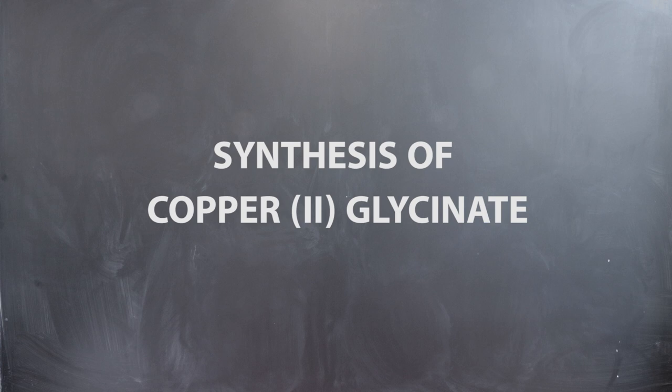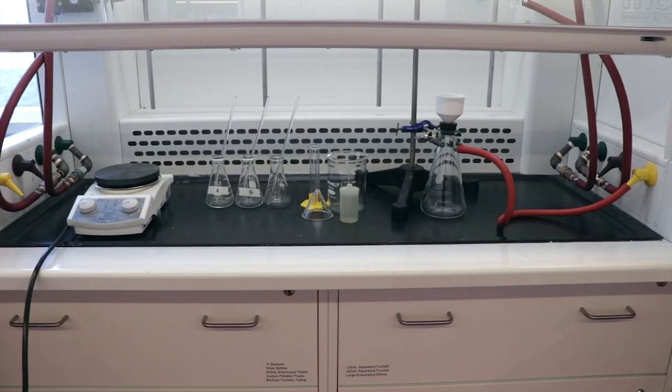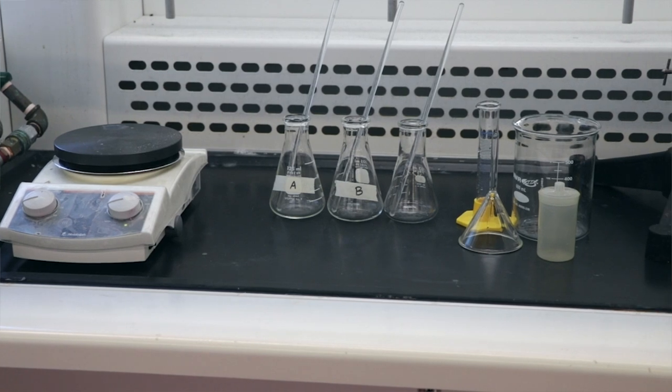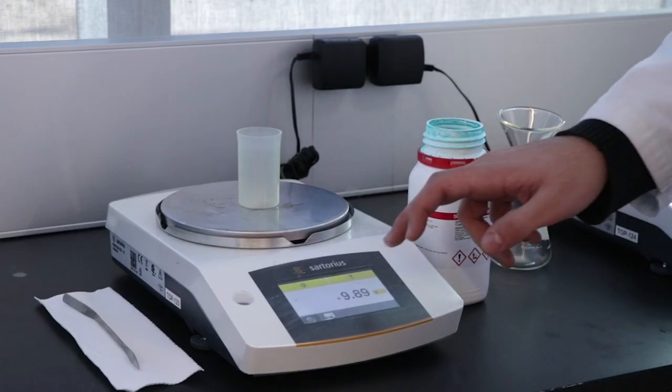Synthesis of copper glycinate. In today's experiment, you will be reacting copper acetate and the simplest amino acid, glycine, to synthesize copper glycinate monohydrate. This is the apparatus we will be using for this lab. All glassware can be found in your locker.